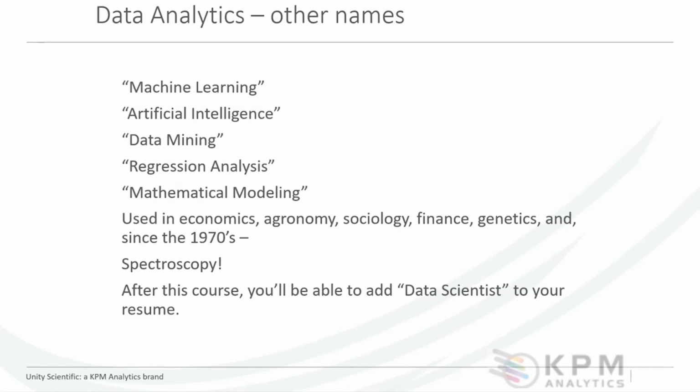There are many names for data analytics out there: machine learning, AI, artificial intelligence, data mining. These are all kind of different flavors of data analytics. They have become very, very popular in the last 15 years or so, 20 years. And really, spectroscopy relates in there.